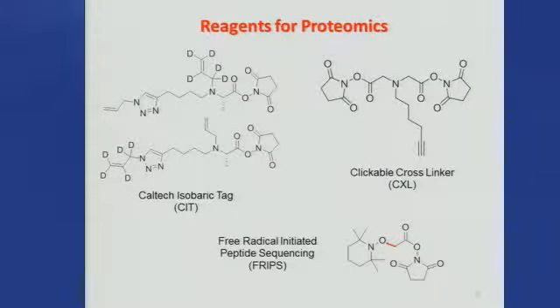We heard earlier this morning that it would be nice to be able to do isobaric tagging that didn't cost a fortune for each experiment. This particular isobaric tag we're giving away to people free on request, and if you synthesize it yourself, it costs about 2 to 5% of what the iTRAQ and other reagents actually cost for an experiment. So you probably could do a large amount of material. But we have a lot of this that we made, and we give it out to people. It's patented, and we figured if enough people find it useful, it'll enhance the opportunities to license it.